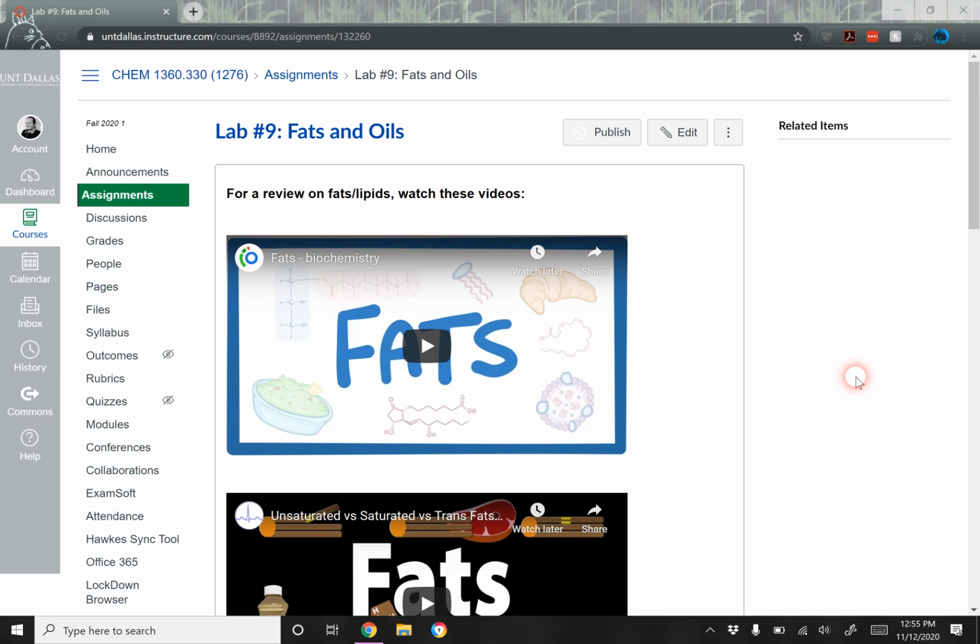Hi everyone, I just wanted to take a few minutes to go over this week's lab with you. There's kind of a lot to unpack with this one, so hopefully you'll find this helpful. So this will be lab number 9, so we're almost finished. We just have lab number 9 and lab number 10 left. So this week's lab will be over fats and oils. So essentially we're talking about lipids.